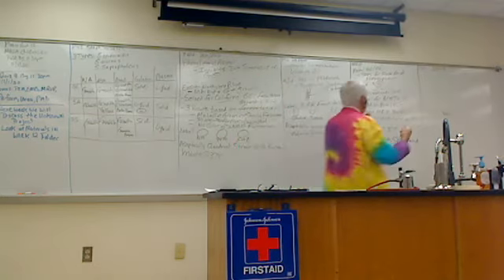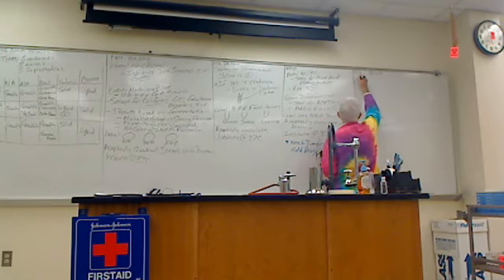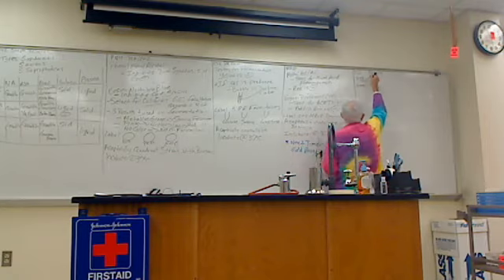Okay, so the last two, again, that you guys will set up over here are on page 52. And I want you to know an equation. Oh, no, chemistry. Yes, chemistry. So this tube, guys, we're going to start out with a urea tube, urea agar tube, that's kind of an orangey color. Okay?